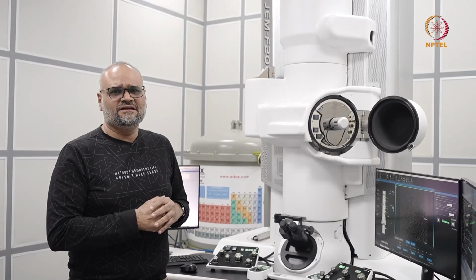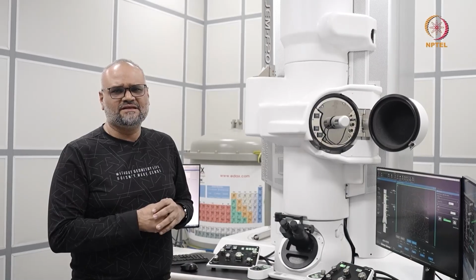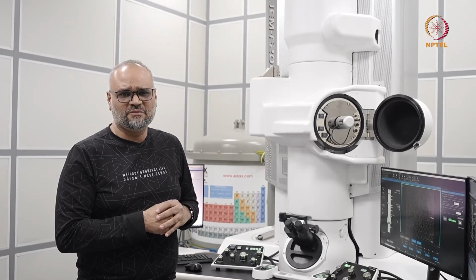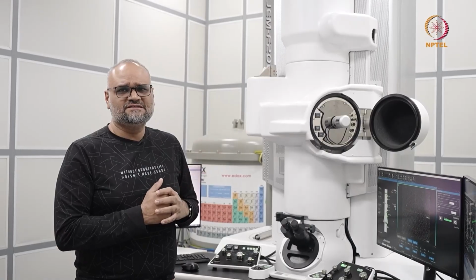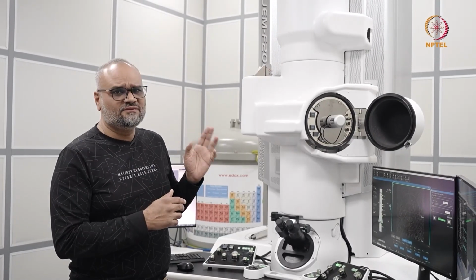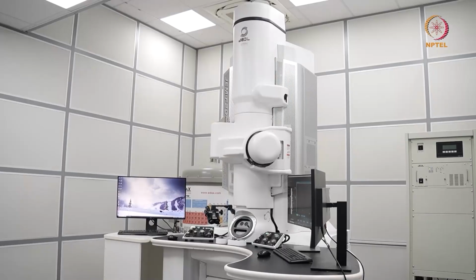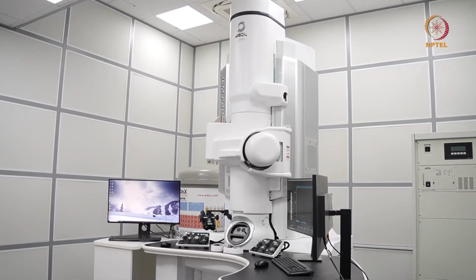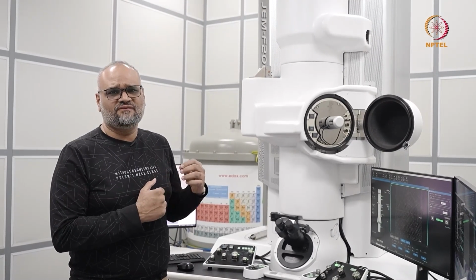If you remember, in the previous lectures, you've seen an example of the 2100 TEM, which has a lanthanum hexaboride filament. If you remember your lessons on the types of emitters, you have thermionic emitters, you have Schottky FEGs, and then you have a cold field emitter. So the idea is, this cold field emitter has a tungsten filament which is maintained at room temperature, and every day you want to use the instrument, you do a quick flash.